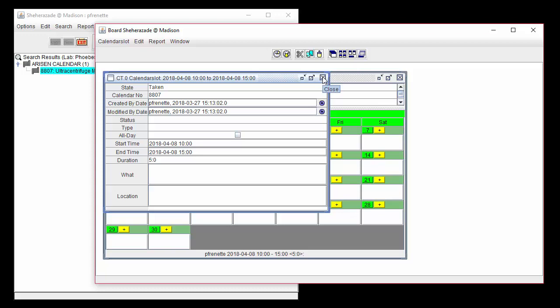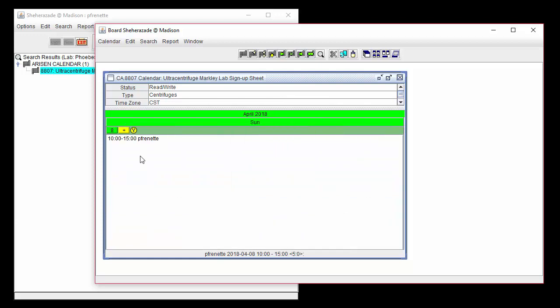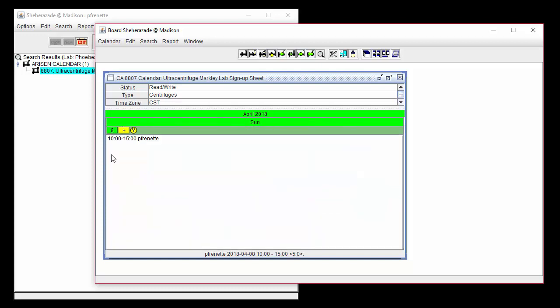To toggle between day and month view, click on the dark green bar showing the date to open the day view, and again to toggle back to the month view. Or click on the numeric day label to toggle the same way between the daily and monthly views.